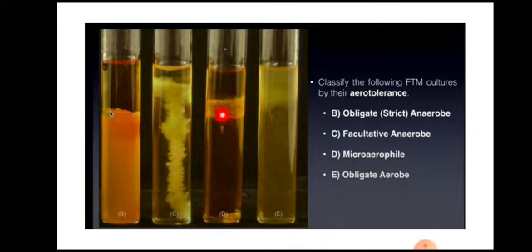These bacteria have a limited oxygen requirement, so they are called microaerophilic. So they grow under low oxygen tension. So this will be the pattern for microaerophilic bacteria. For example, lactic acid bacteria, they have this kind of pattern. This is for Clostridium. You may find the examples for facultative bacteria as well.